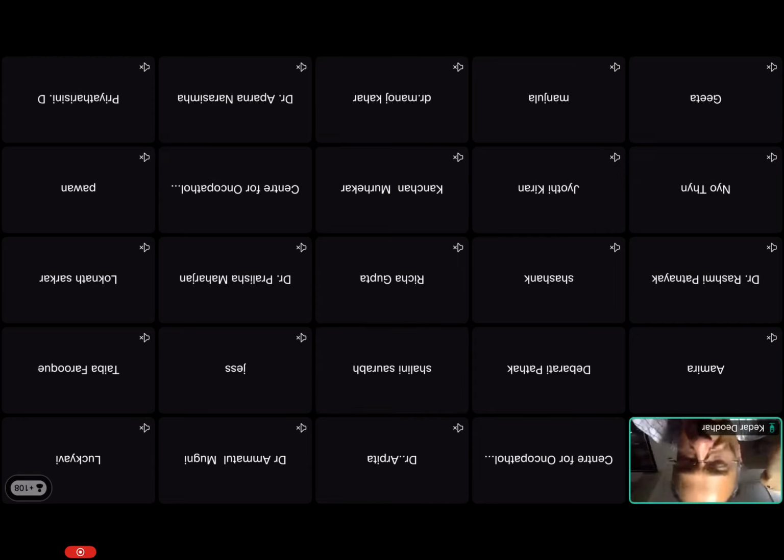So there's another question: why is the stomach specimen cut from the greater curvature? That is a standard practice. It's nothing hard and fast in that. Many times we have a tumor on the lesser curvature or anterior or posterior wall. It is somewhat easier to cut it from the greater curvature, and also easier to keep the orientation after cutting from the greater curvature. So this is just a dictum and not a hard and fast rule. Because if you have a tumor in that location, we will cut it in the opposite direction. Thank you, sir, for the explanation.